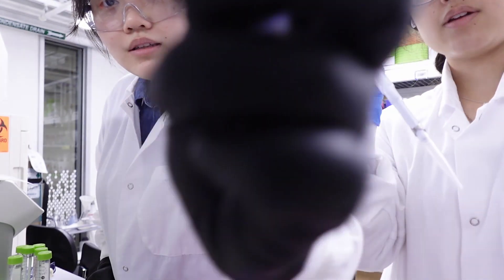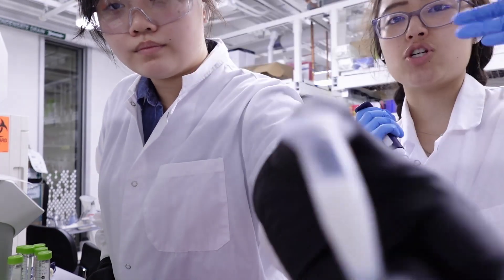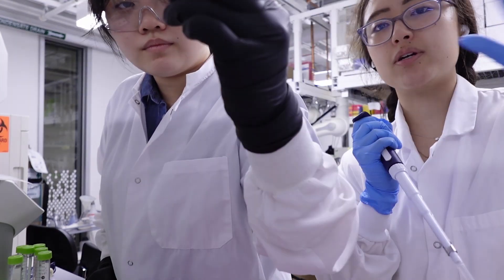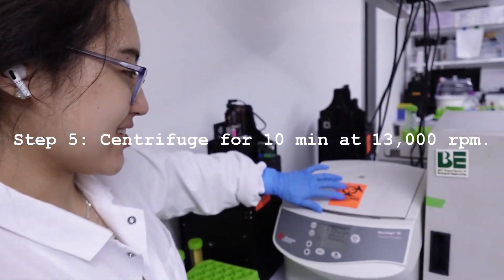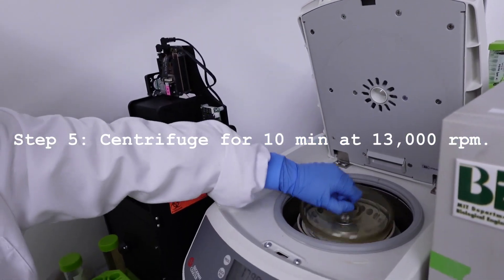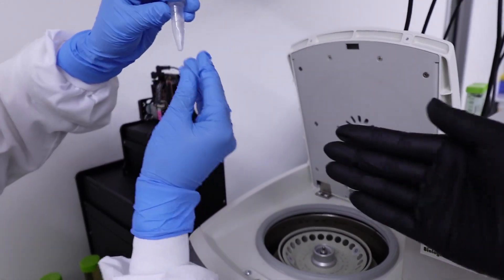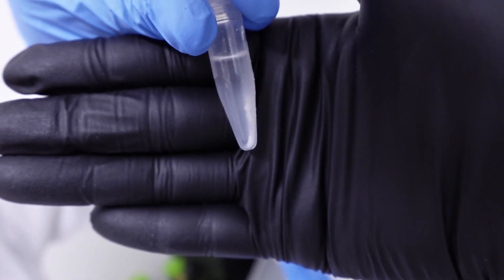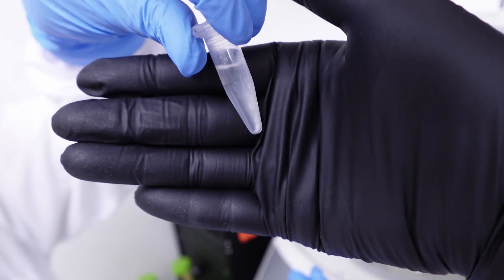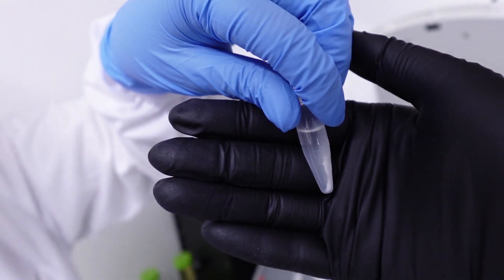So we immediately close and invert it right away because we don't want localized precipitation — we don't want the buffer to just precipitate the very top of the mixture. We want to make sure it gets through everywhere. So the centrifuge run is finally done. We can take our tubes out and you can see on this side we have a very nice white pellet, which we want to avoid. So we're going to try to pipette out the liquid without touching the pellet at all. That's important because the more of the pellet we get into our liquid, the more contaminated our result is.